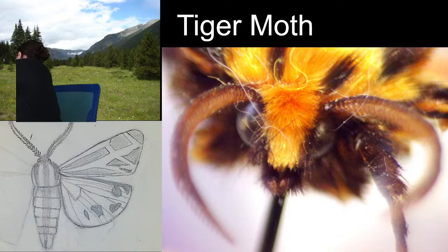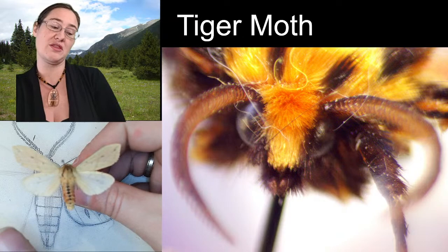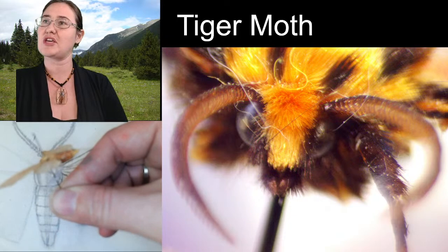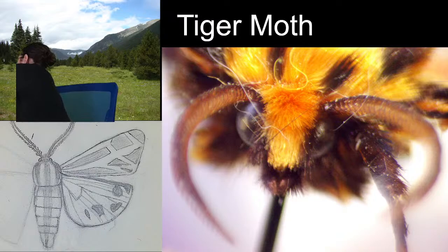But I do have this lady right here, an Isabella tiger moth, and you'll notice that there's a couple of similarities between this one and the one we sketched. It still has that black band down the center of the abdomen. She still has a pink color on the abdomen, although it's a little difficult to see as this specimen is a little bit faded. But that's an Isabella tiger moth. So all tiger moths are going to have similar features.